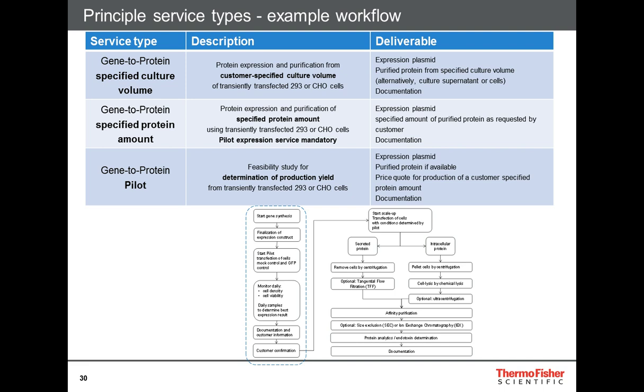And in that case, you would, of course, get the synthesized gene in an expression plasmid. You would get the purified protein from that specified culture volume, or you may also get the raw culture supernatant or the cell pellet.